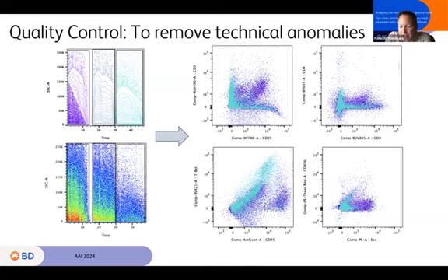And what happened is as this person was acquiring data, and so the plots on the left here are just time on the x-axis. This is a gated overlay where you can see that the first, whatever, 12 to 15 seconds are purple. The middle one is this gray-blue. The ending is teal. This is the density plot of that. So lots and lots of events flying through at the beginning, less in the middle, almost none at the end. And you can see we've mapped the purple, light blue, and teal populations onto a couple of 2D plots.